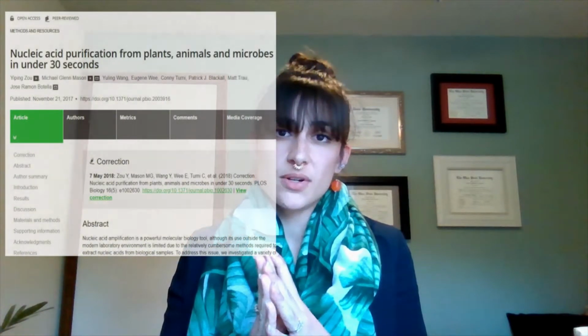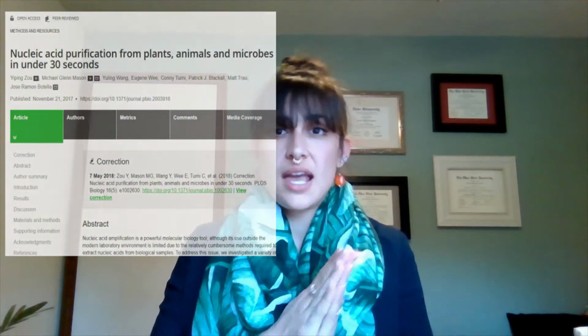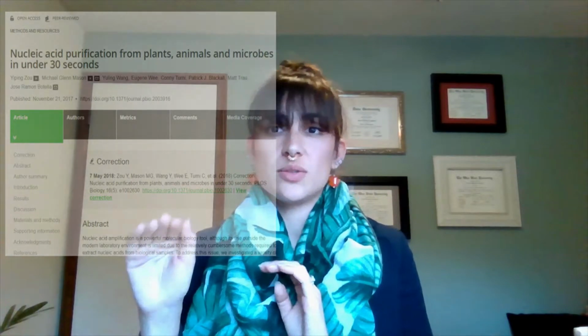The other experiment that's needed is to verify that the direct part of the solution works. This would involve macerating a tiny bit from either a leaf or a flower petal or a brassy stem from a tree that has ROD of each type and putting it directly into the reaction at the start. If the direct part does not work, there's a simple and inexpensive 30-second protocol that can extract DNA and be inserted into the solution before the PCR step.